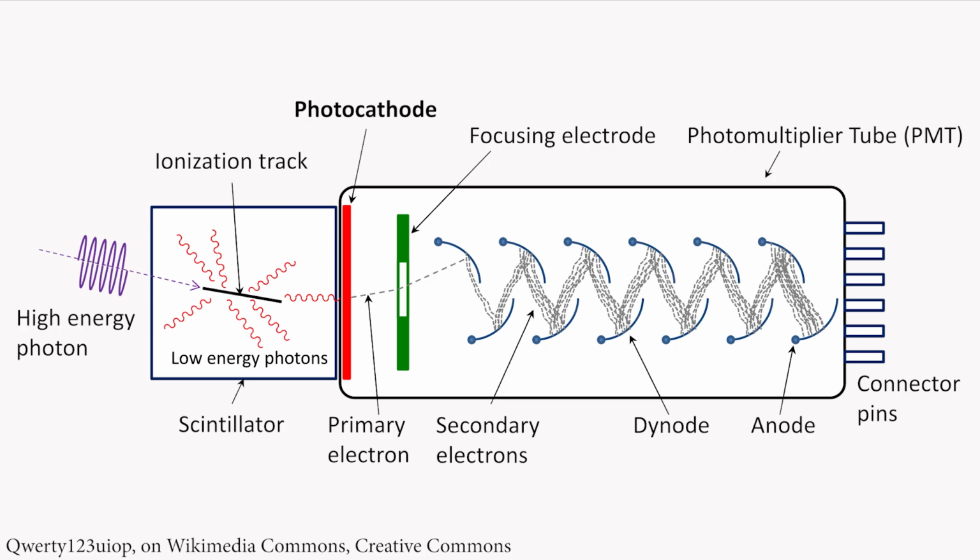So when those lower energy photons strike the photocathode, you get an electron or a few electrons. And then this is focused through a little ion optic there into a series of metal plates. With each metal plate, that electron causes the release of more electrons, and it amplifies it. It causes this electron cascade. This part should look very, very familiar. Think about why that is. I have this electron and it hits a plate, and then more electrons come off that plate, and then even more electrons come off the next plate, and more. That's because that's an electron multiplier. That's what we did in mass spectrometry.